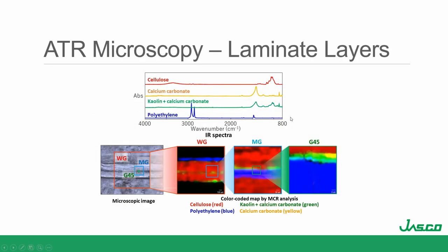So this is an example of a multi-layered sample that was taken with the wide MCT. This is 400 by 400 microns, and this is the standard ATR, with an area of around 60 microns. And what it found, this is good for the wide angle.